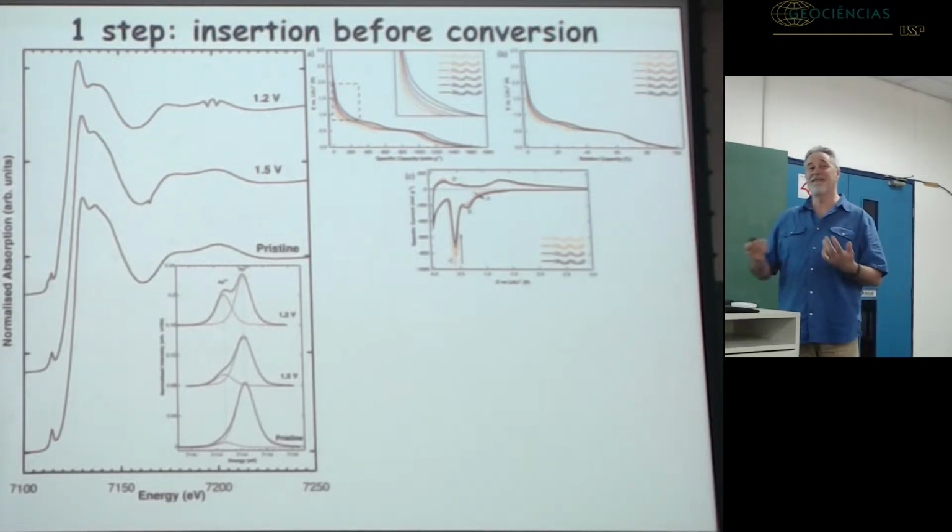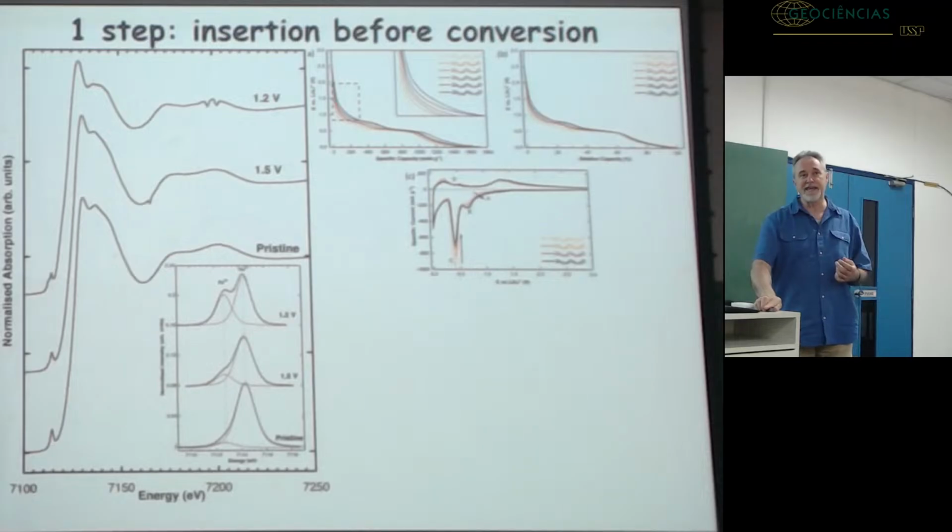Again, what does it depend on? Usually this extra transition appears when you have two neighboring trivalent manganese oxides. Basically, it is an electron transfer transition between the two neighboring manganese via the shared oxygen. So, for example, when you have a chain of octahedra with two neighboring trivalent manganese oxides, you have this extra transition, and you see, oh, look, we have also some 4+ manganese, and actually it's not. So the interpretation is not straightforward. It's good to have some experience on a large variety of model compounds.